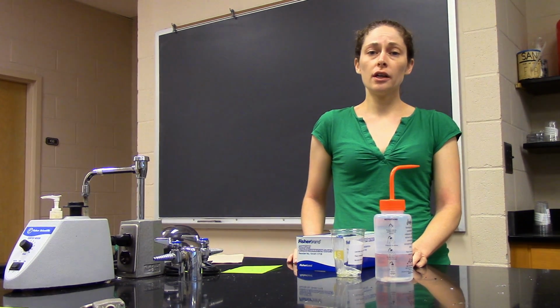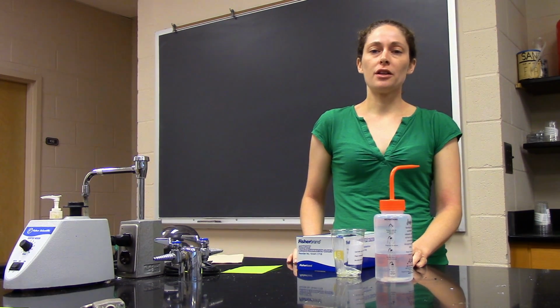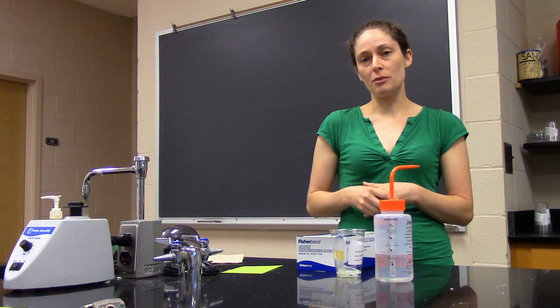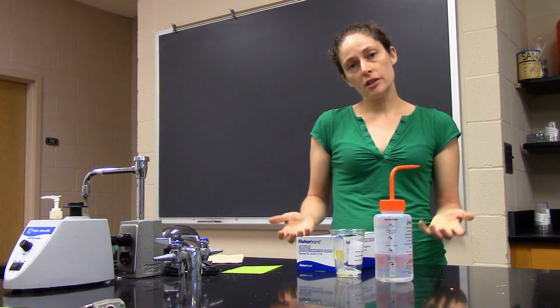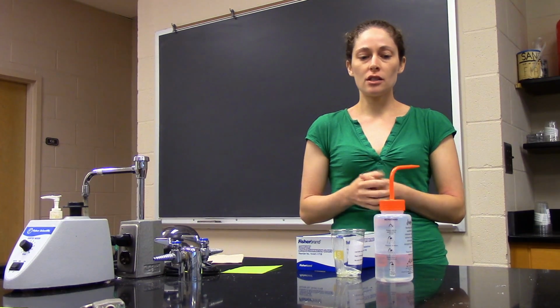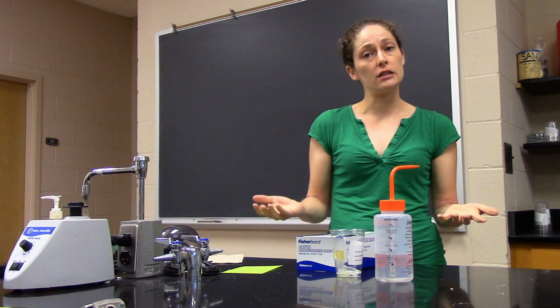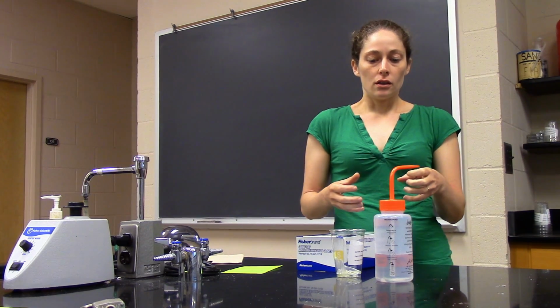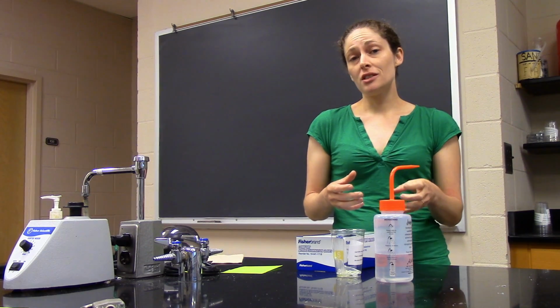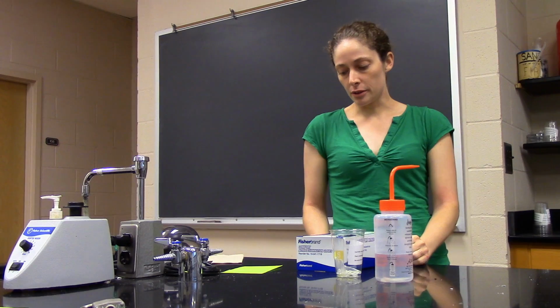Okay, when you're doing biological experiments, you often need to be really careful of contamination. So to avoid contamination, biologists try to use sterile technique as much as possible. All right, so why are we concerned with contamination? Well, if you're trying to study bacteria on a plate, you don't want other bacteria from the air growing on that plate instead. If you're trying to do a very technical experiment like a PCR, you don't want DNA from your skin getting in your tube and ruining that experiment.